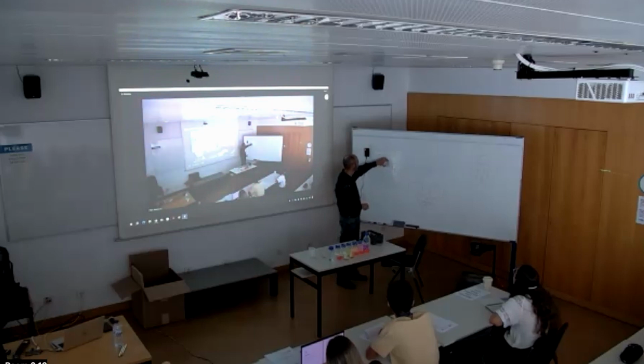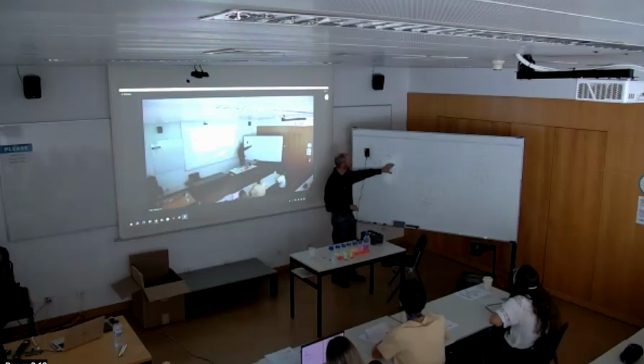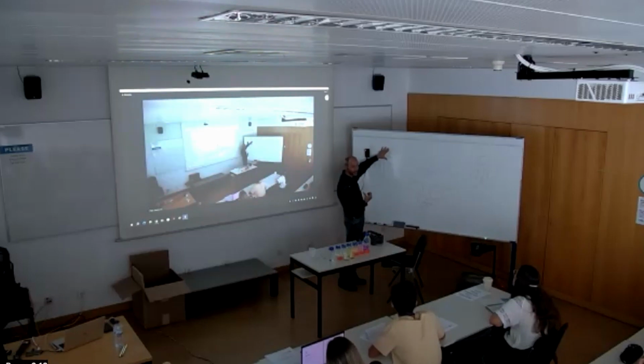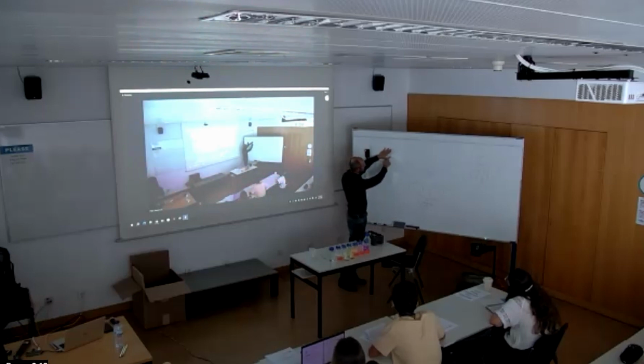And then I want to show you another thing. So now this one. Do not consider the light path until here. Let's consider that our light is passing from glass to air. And then what happens is the same thing that happened when the light was coming from the water to the air. So it bends outward with respect to the perpendicular to the surface of separation. So you see we are traveling with a certain angle, and then the angle increases.